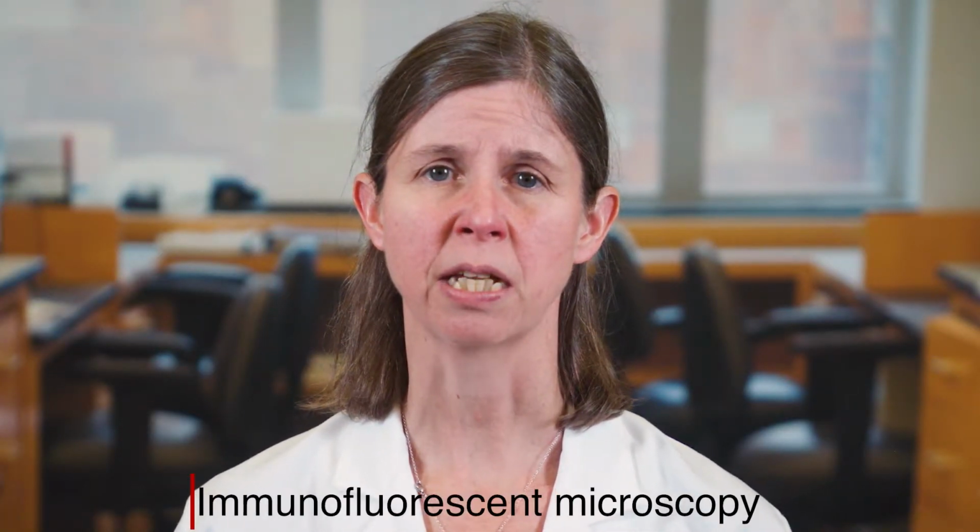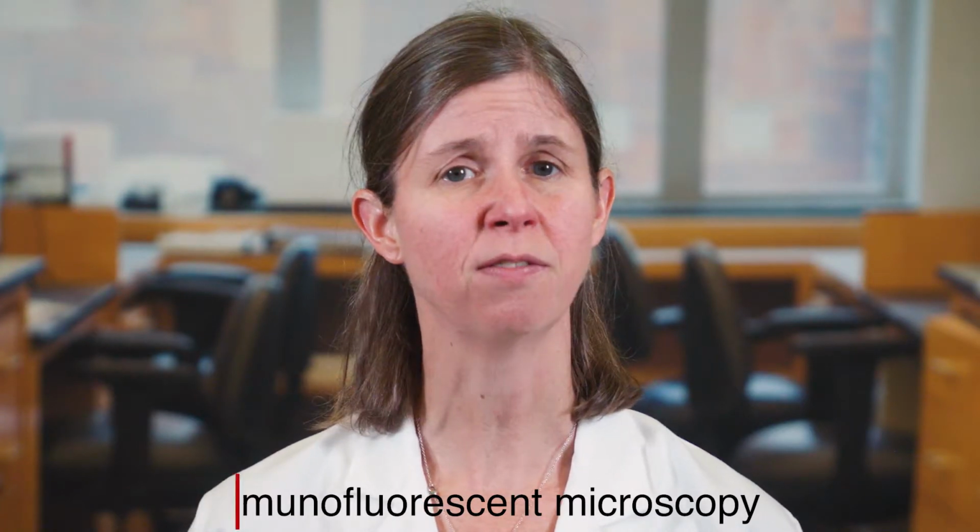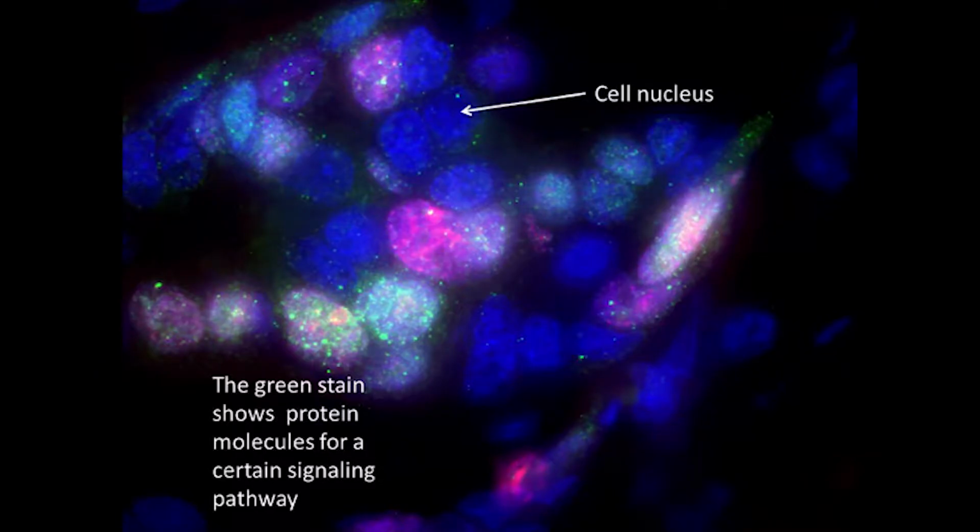Next are examples of immunofluorescent microscopy. The cells have been stained with dyes that emit light of different colors when exposed to ultraviolet light, or UV. The cells are viewed through special UV microscopes. The image is also of a lung tumor from a patient photographed at much higher magnification. In this image, the blue color is cell nuclei. The green, or yellowish color, shows the presence of protein molecules for a particular signaling pathway that transmits signals from the cell surface to the nucleus.